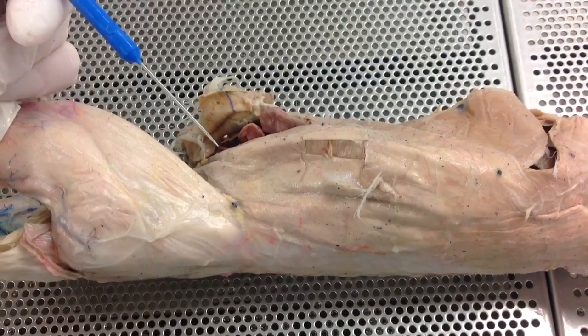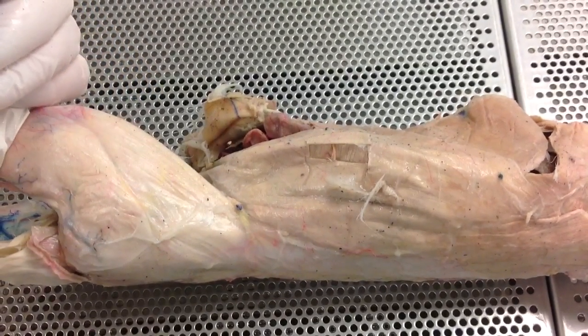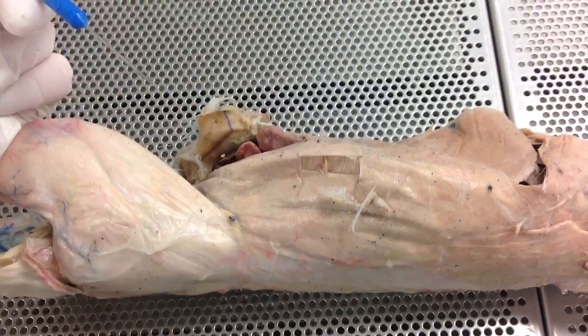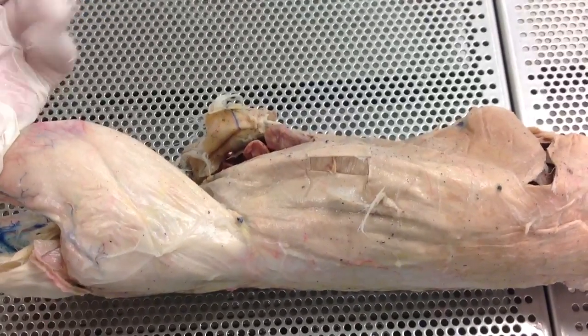This is the trunk muscle superficial and deep on the ventral side of the rabbit. This is going to be your rectus abdominis. Your linea alba is going to be the imaginary line that goes down the middle of the rabbit. You actually can't put a pin in it to identify it like that — you're just going to have to know that it's the imaginary line. Again, that's called the linea alba.